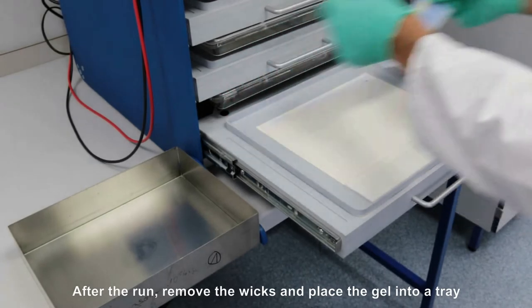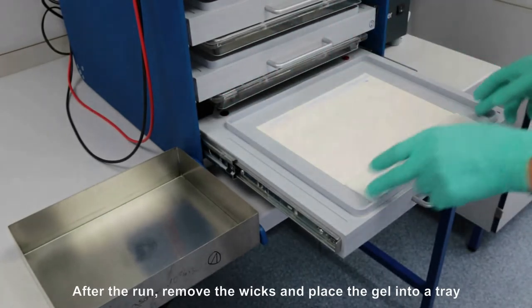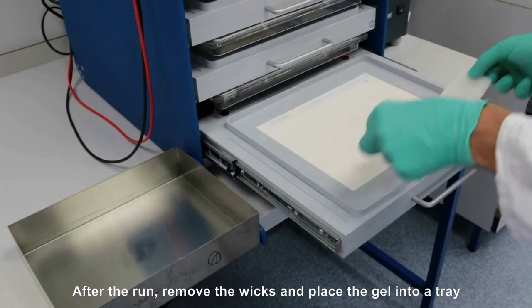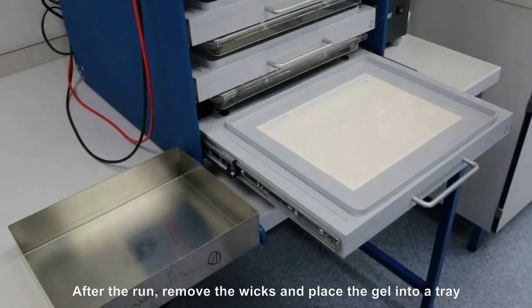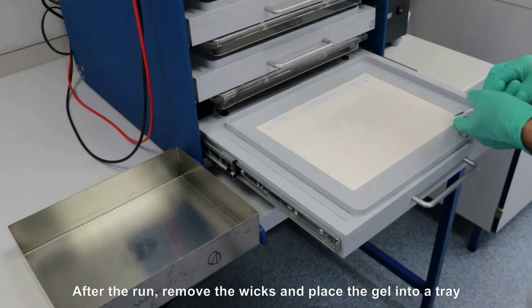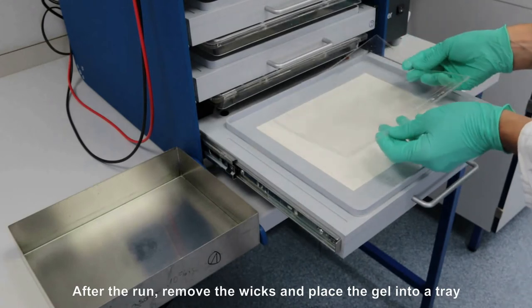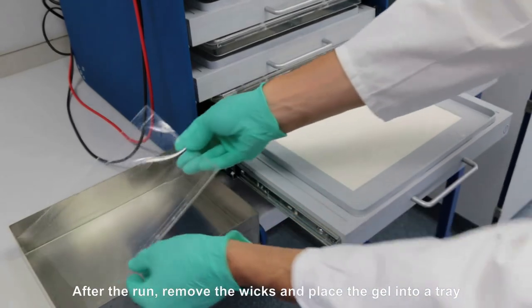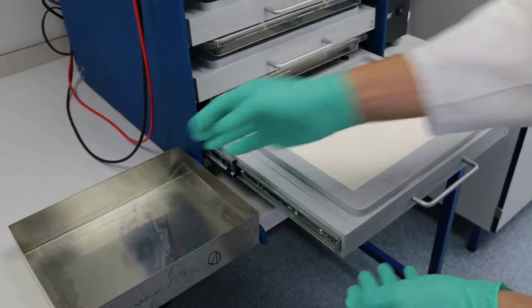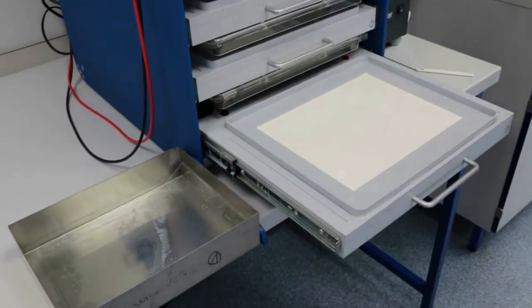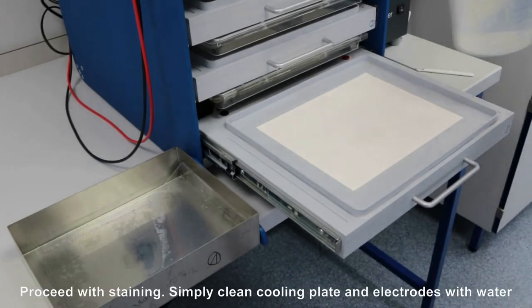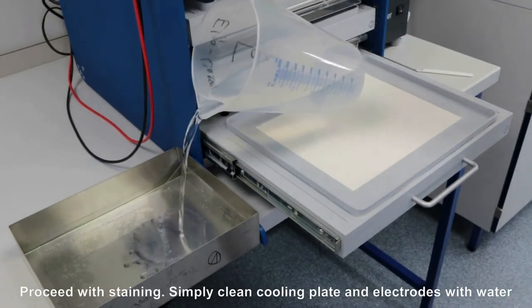When finished, remove the wicks and place the gel into a tray. Proceed with your staining protocol. Simply clean the cooling plate and electrodes with a water-soaked cloth.